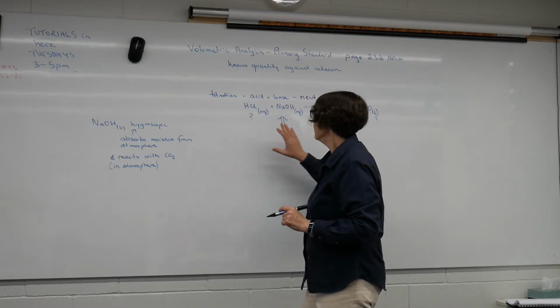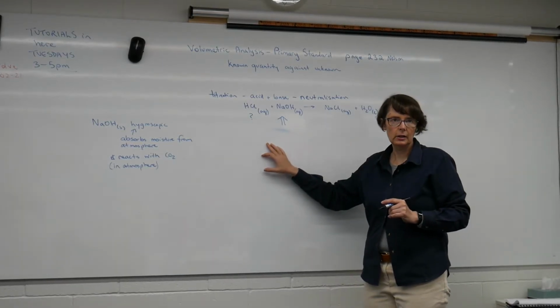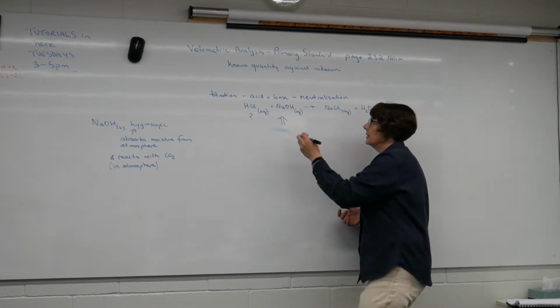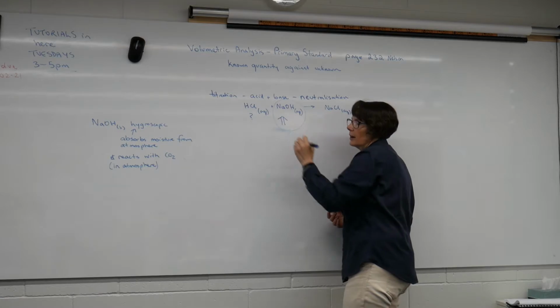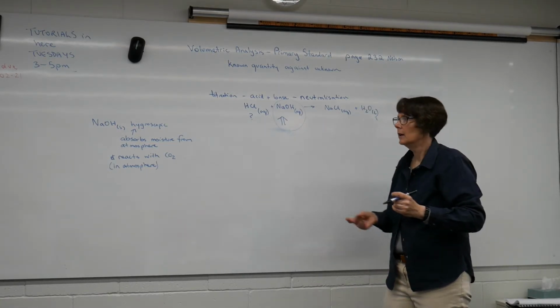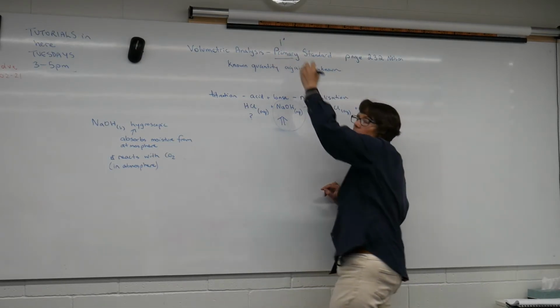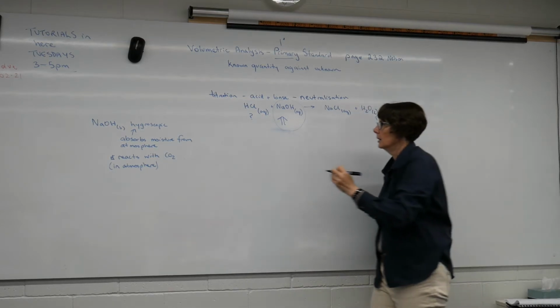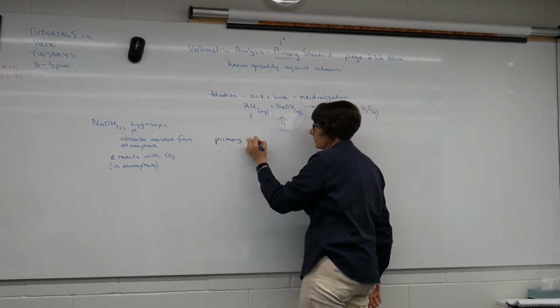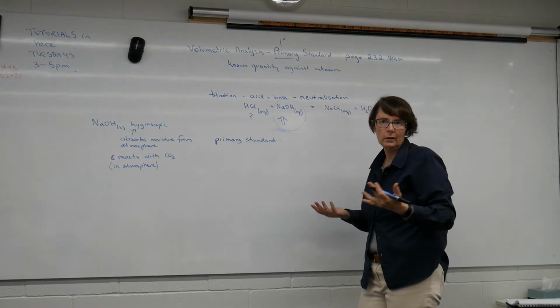I don't know. And so we can't just do this titration as it stands, like this. What we need is another step, and that is something that we can titrate against the sodium hydroxide to standardise that solution. And this is why we need a primary standard. So the primary is the one that we start with. And a primary standard needs to be unreactive with the atmosphere and water.